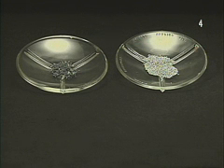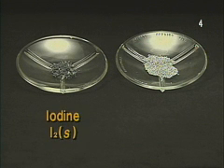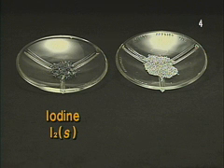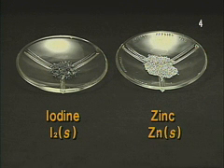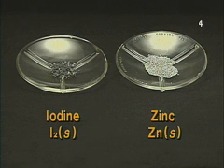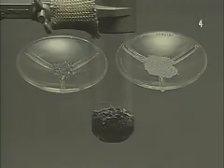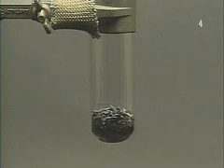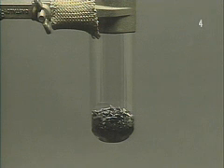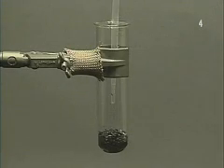The solid on the left is elemental iodine; on the right is zinc metal. The test tube contains a mixture of solid iodine in excess and finely divided zinc metal. A small quantity of water is added to provide good mechanical contact between the zinc and the iodine.